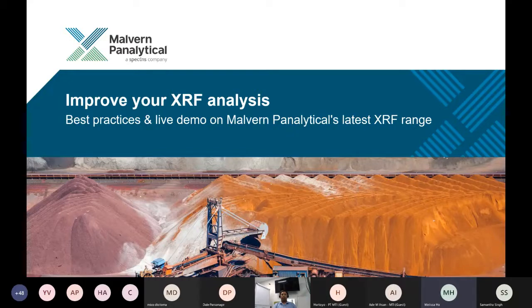We are streaming to you live from Perth, Australia, in our applications laboratory. Let me introduce my colleague that you see online, and you see his video feed right now. His name is Hari Baska, and he is our laboratory manager, and also he takes care of all our process and automation solutions. So that's really useful in case you're looking at high throughput environments.